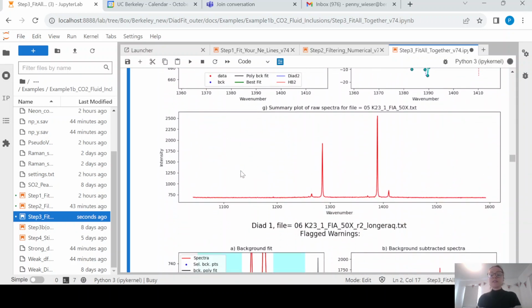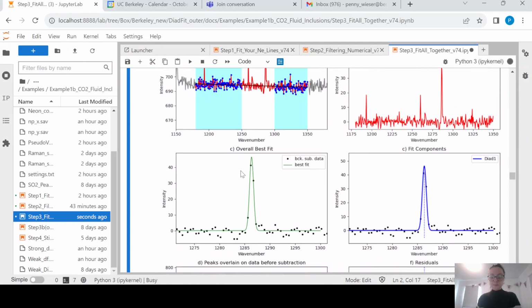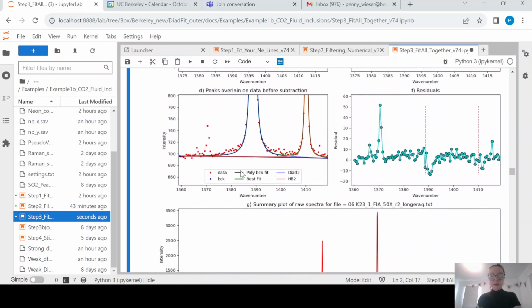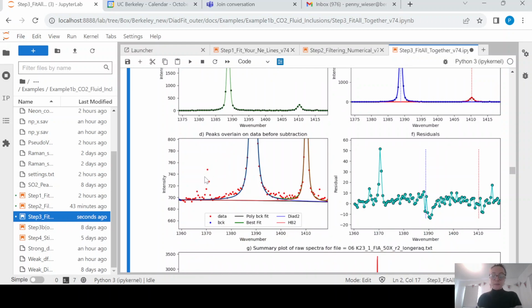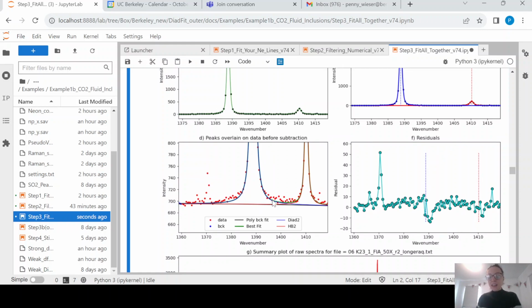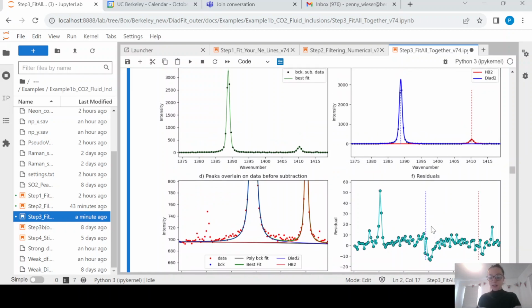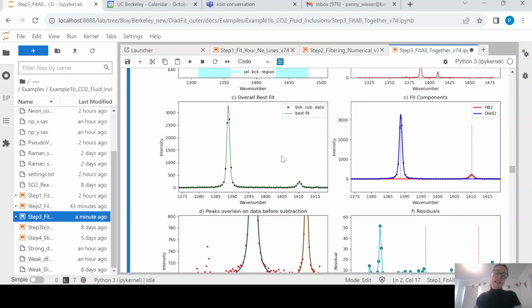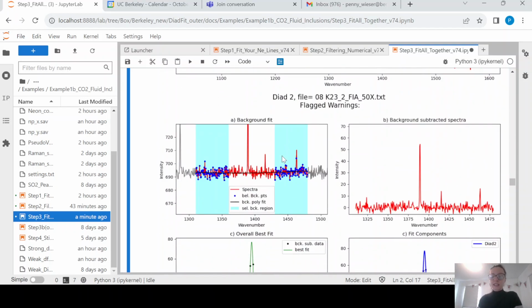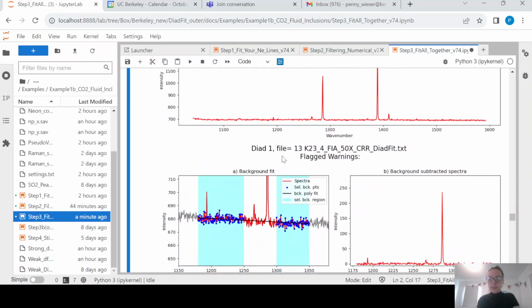You're really going to want to do this, because if you've got a bad fit, you're going to want to pull it out. You might not trust the data from it. You can see this is maybe one. This is a C13 peak. So this is maybe one where it would have made sense to put it in a medium category so that you fit that C13 peak. You can see though that the elevation of this region really isn't too severe. We really don't need our Gaussian yet, so this is still doing a good job of fitting the peak. There's a residual there of about 10 as you tail off, out of 3,000. That's a pretty small residual as things go. So I'm just scrolling through all of these and checking I'm happy with the fits.